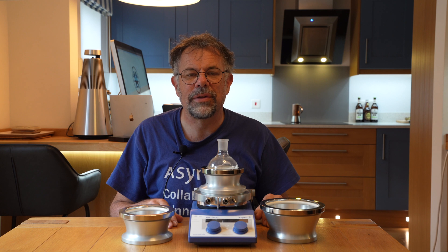Welcome to Asynt. My name is Martin Fordham and today I'd like to tell you about our DrySyn Snowstorm 1 reactor system.